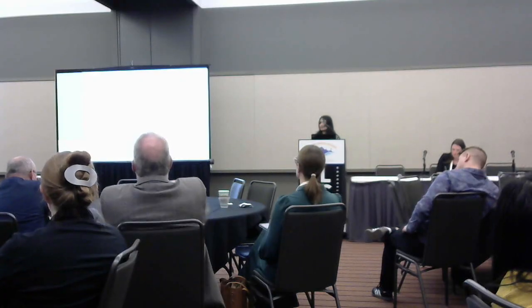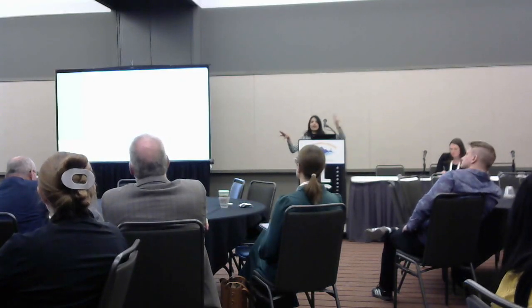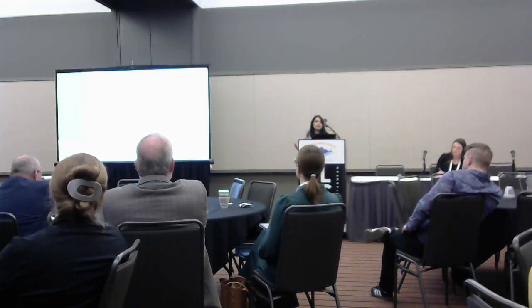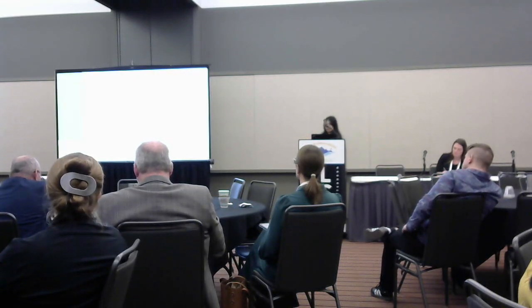Something which requires a lot of interaction between you as the researcher or the user and the application, because HPC is like a headless system. You're going to do everything through a command line interface. So something that requires interaction is not compatible with HPC.